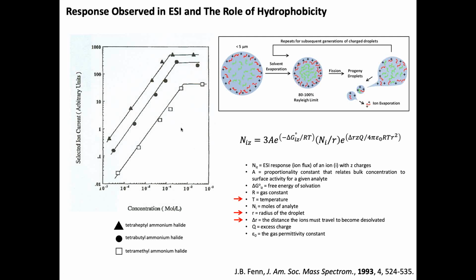If you're looking at a biological fluid or cell, you're going to have a lot of things that are going to come out at the same time. And they can be based on hydrophobicity, but it can also be size, the 3D rotational, I don't remember the name of it, but it's how big the hydrodynamic volume is of a particular molecule.